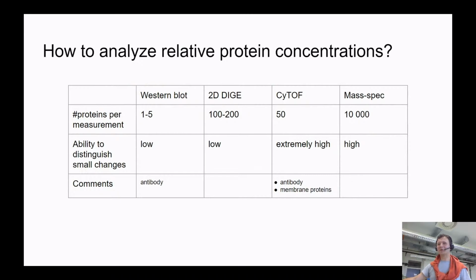Yeah, that's actually a very good question. One of my colleagues participated in my course, and she worked a lot with CYTOF. During the class, I said it's a method used strictly for membrane proteins. After class, she came to me and said that's not fully correct. You can make the cells permeable, so make holes inside the cells, and incubate with antibodies, so the antibody will pass inside the cell. I have to say that's still not very common, but people do that.